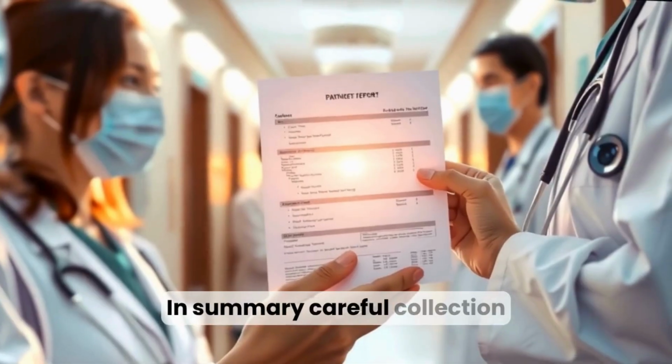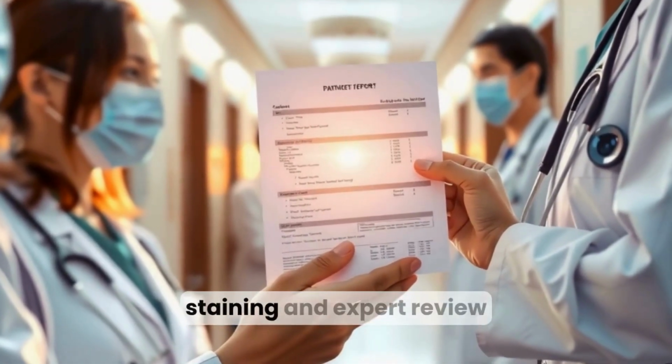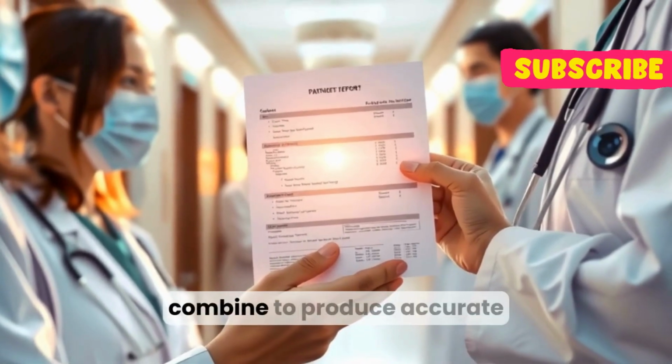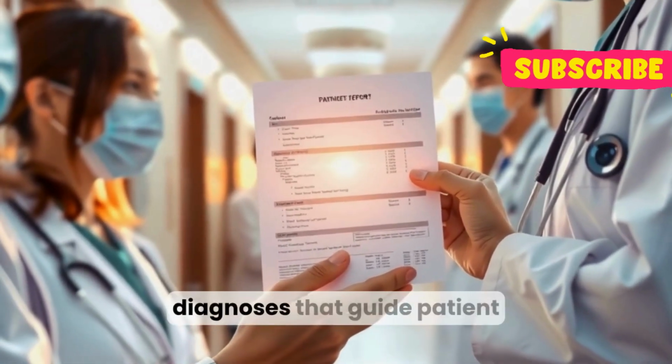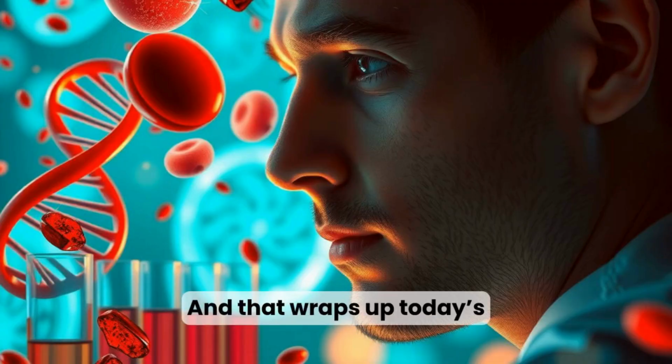In summary, careful collection, fixation, grossing, processing, staining, and expert review combine to produce accurate diagnoses that guide patient care. And that wraps up today's topic.